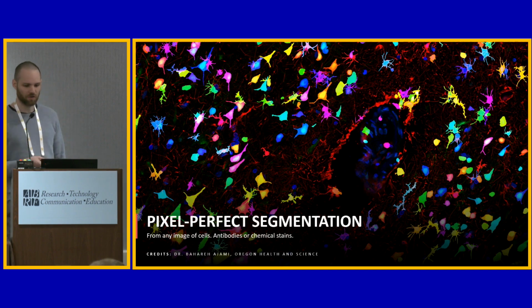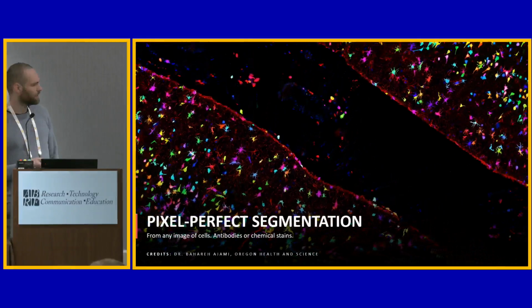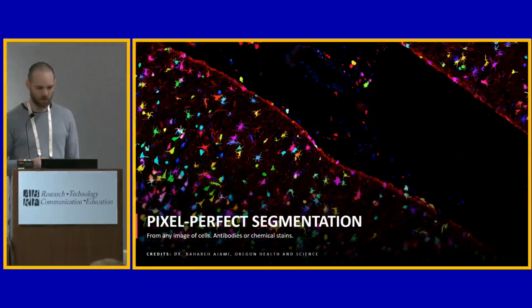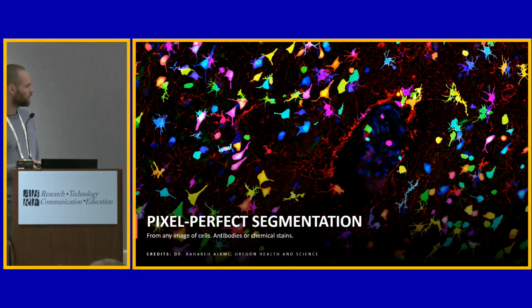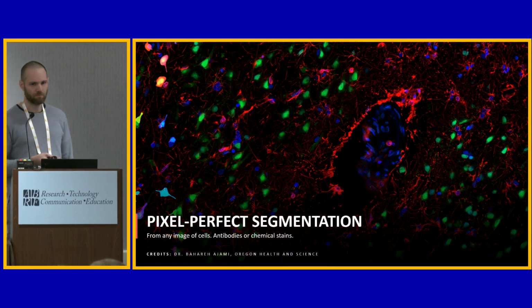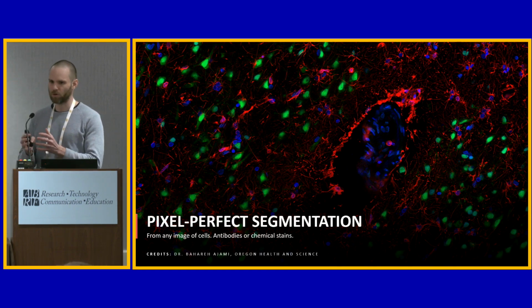So this is segmentation on Akoya data, segmenting neurons, glia, and astrocytes and microglia from Alzheimer's disease patient brain from GFAP, IBA1, and NeuN. And I think that makes the point very nicely that the cell segmentation really allows you to map markers even to locations distal from the soma, because it doesn't just rely on the DAPI, doesn't just rely on blobs of high intensity.